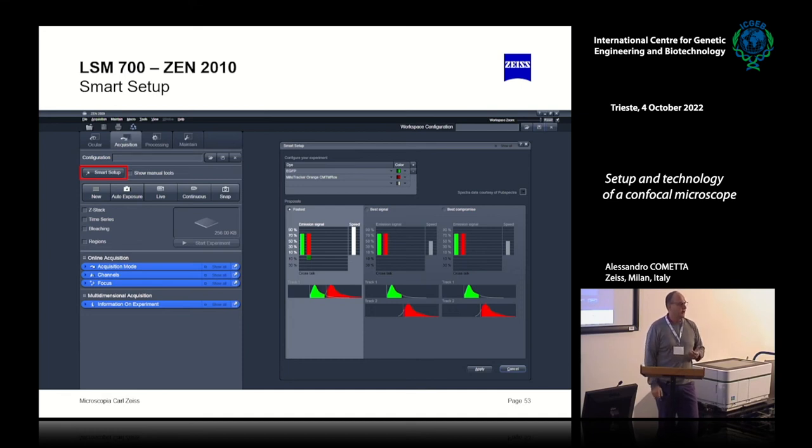It's like driving a car. You can now enter in some places in Shanghai, as an example: you enter a taxi, you open the door, and you say, please go to that position. Nobody is driving. The taxi will bring you there. But you don't know if there is something not inserted in the navigation system. It can maybe make it the wrong way. If you know, and who knows your sample better than you? For sure not the system. You know your sample much better than the system.